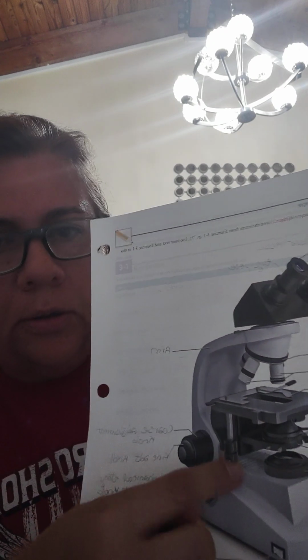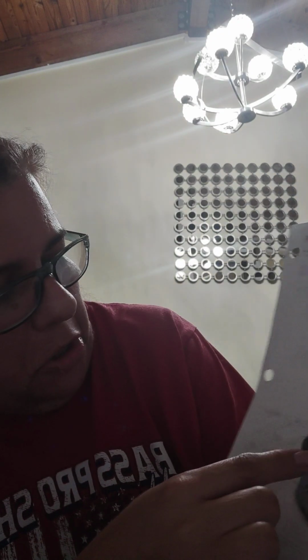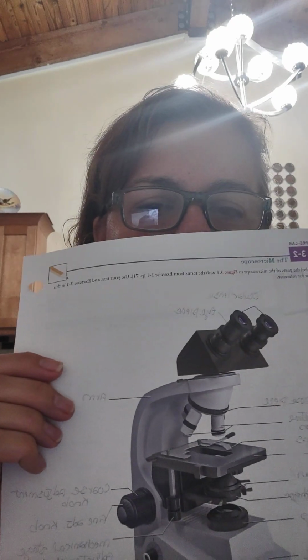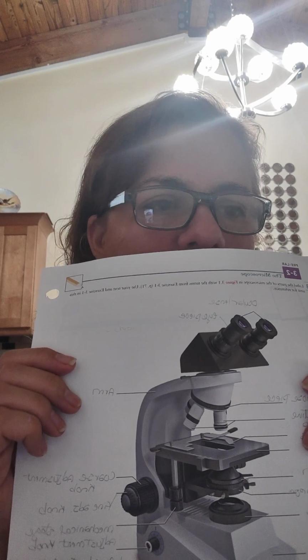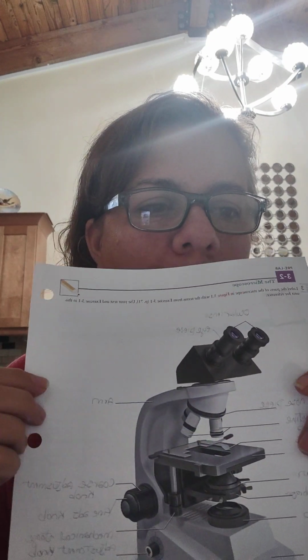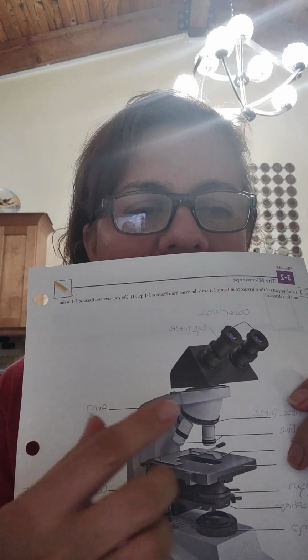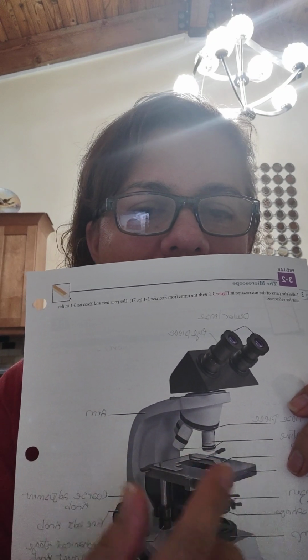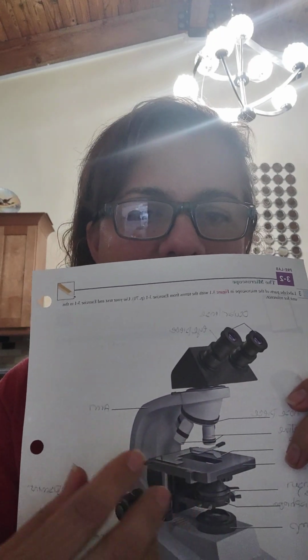You also have the mechanical stage adjustment knob, over here. What this one does is it moves the stage either left or right. Let's say you have a specimen with epithelial cells, or connective tissue, or whatever your specimen is. You want to make sure you scan the whole slide because you might miss something on the slide. You want to catch everything. So you move it left and right to be able to get everything on that slide.